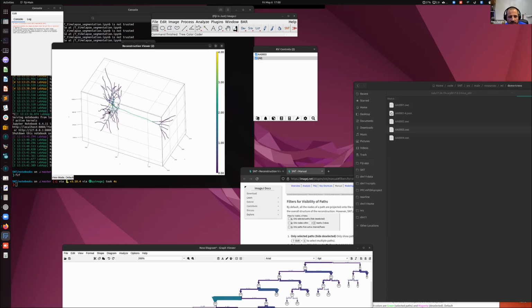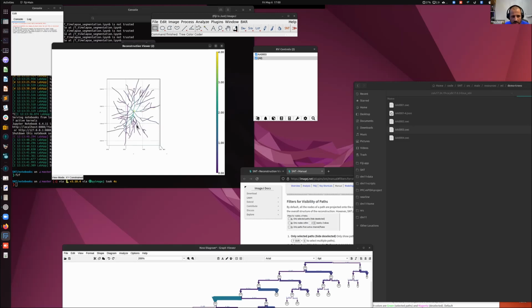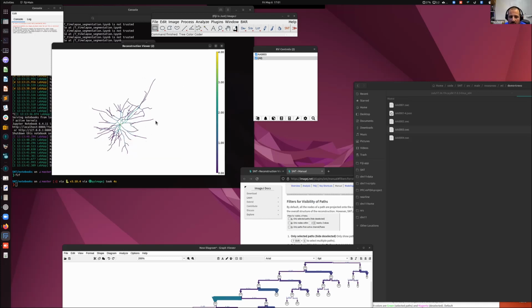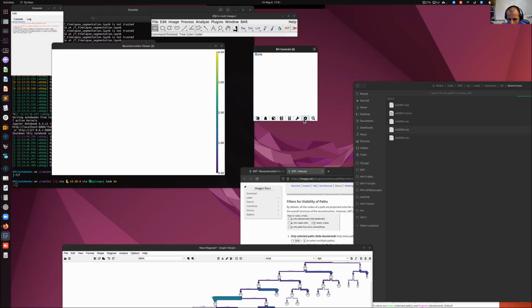If you double click, you have an animation. It's quite useful. And you can basically restrain if you just want to move this axis, or if you want to have a free rotation. Okay, so I'm going to delete everything now so that we can start fresh. Okay, I'm going to wipe the scene, wipe everything. Yes, and the bar stays because it's considered an annotation, and those ones persist. Okay, so you can remove all color legends.